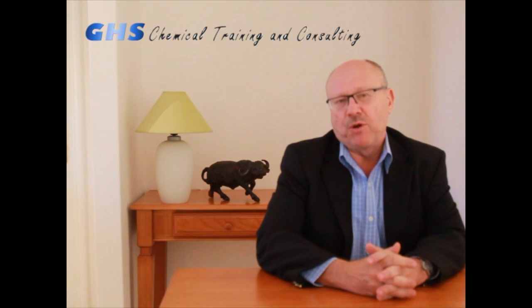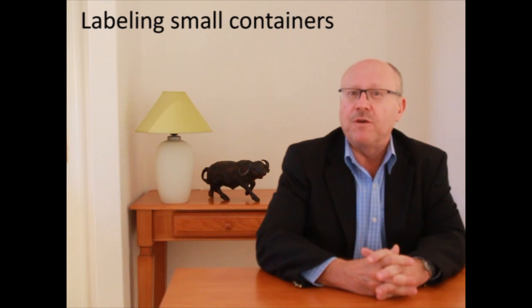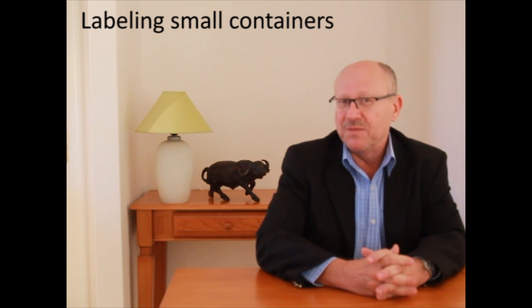We provide training programs in the Globally Harmonised System for labelling and safety data sheets of hazardous substances and mixtures. During my public workshops, I'm frequently asked by representatives from the laboratory sector about the level of implementation of GHS in laboratory reagents and chemicals. In this second session on this topic, we have the very interesting issue of labeling small containers.